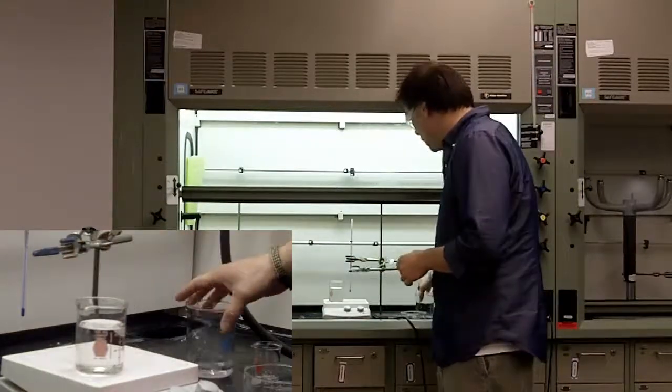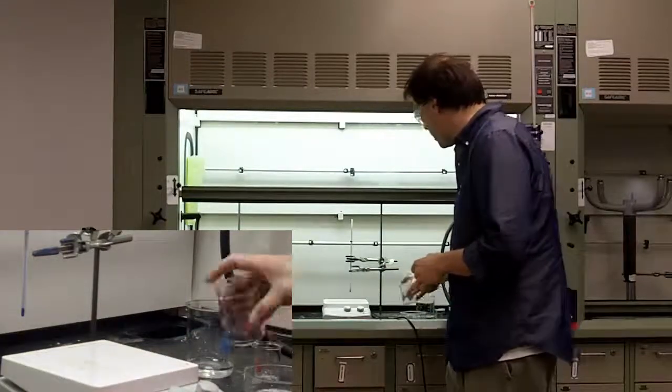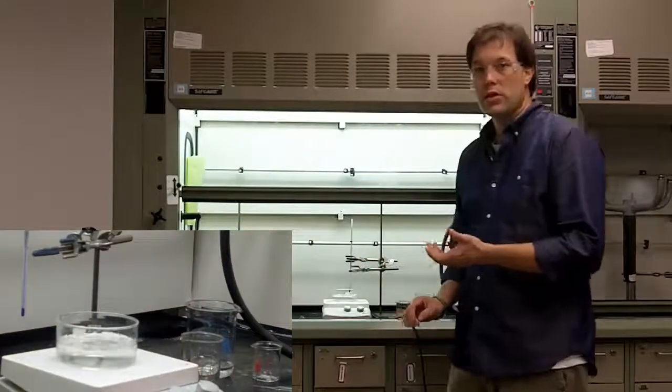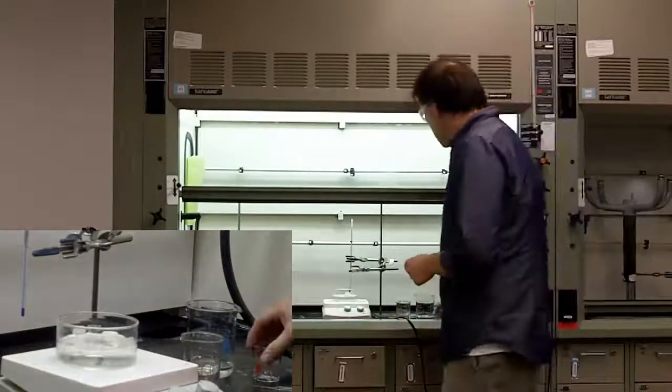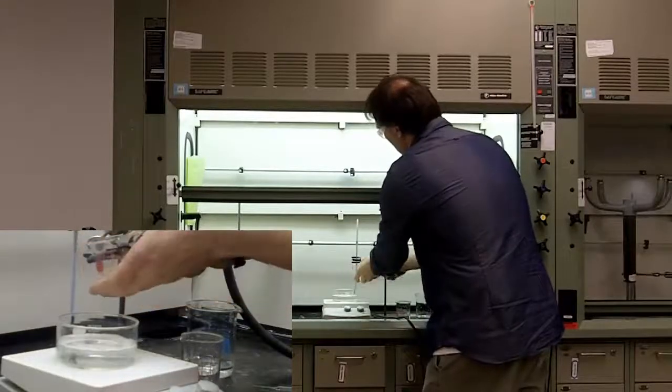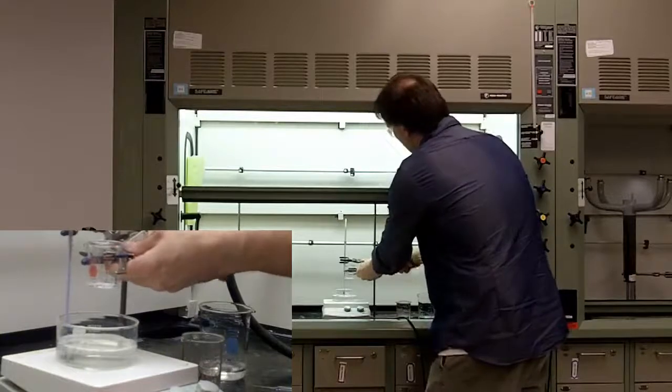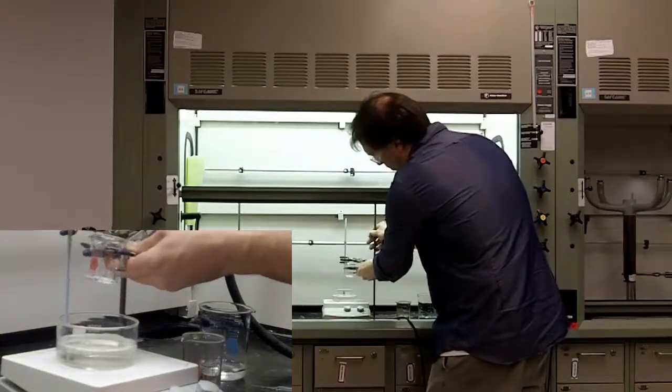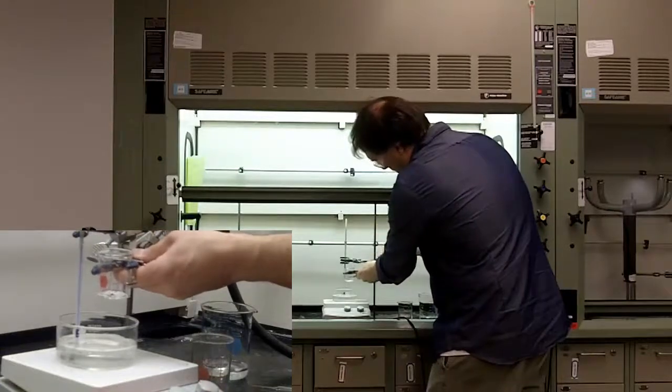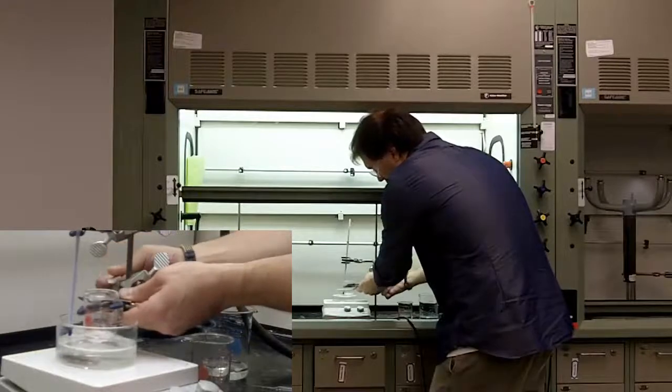Now, what about if we don't have water as a solvent and we have a different liquid as our solvent that we want to recrystallize from? Well, in this case, you can set it up the same basic way. Again, having your material in the beaker and then having that beaker inside the water bath, just like before.